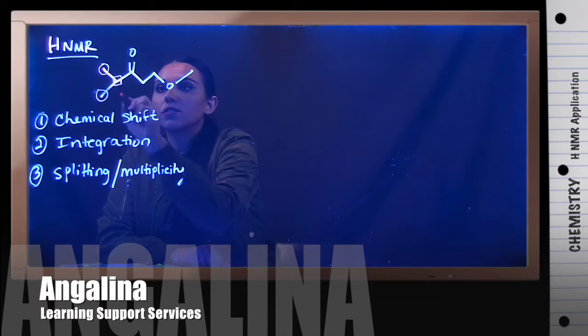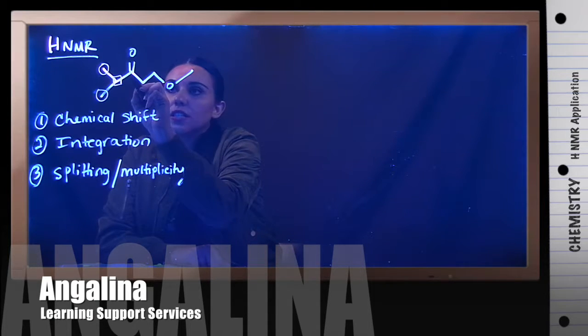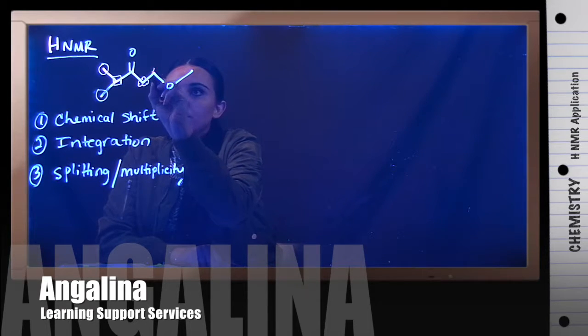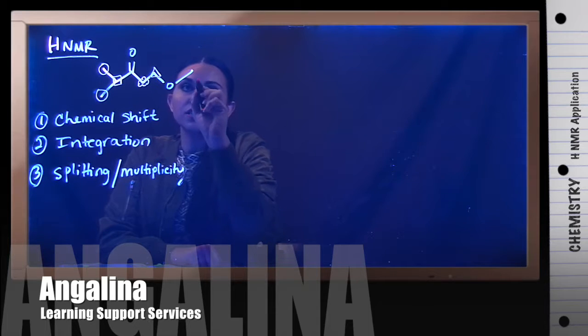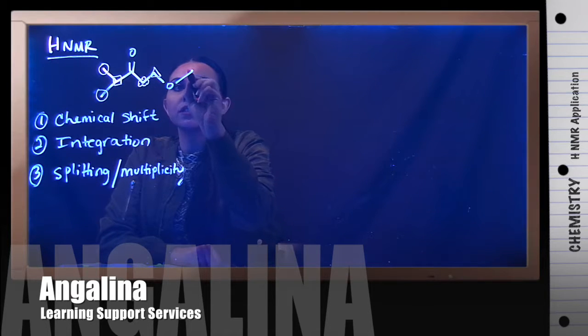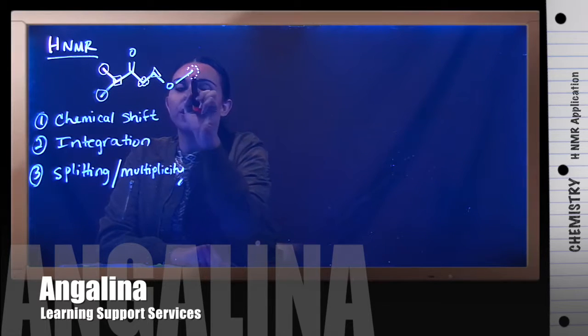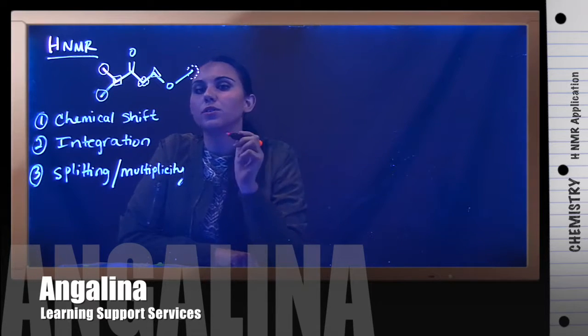Here's another signal. There are no hydrogens here because this carbon already has 1, 2, 3, 4 bonds. This carbon has only 2 bonds, so we know we have another one, so let's make it a different shape. And then this one is going to be different. This is an oxygen, and then this is the last one, which is going to be different. So in total, we should have 1, 2, 3, 4, 5 signals for this molecule.